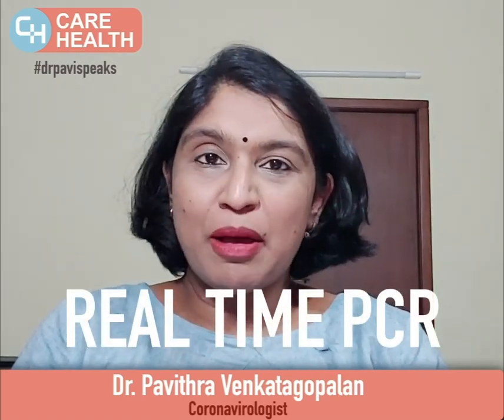Today the topic of discussion is real-time PCR. It's a question that's come up over and over again, where people see this term in the newspaper, in the news, in their own blood reports without really understanding what it means. There are many terms thrown around: CT value, what does real-time PCR mean, and things like that. So in this video, I'm going to explain to you what a real-time PCR is.